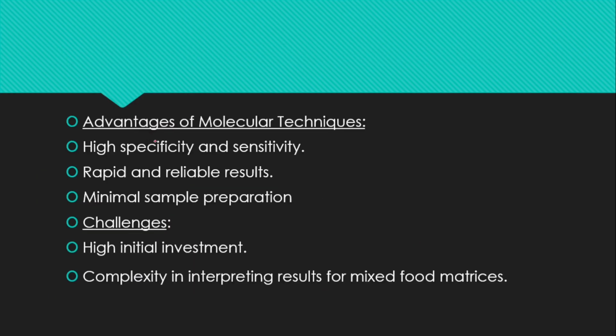Coming to the advantages of the molecular techniques, they are highly specific and sensitive, give rapid and reliable results, and need minimal sample preparation. Coming to the challenges, high initial investment is needed and there is complexity in interpreting results for mixed food matrices.